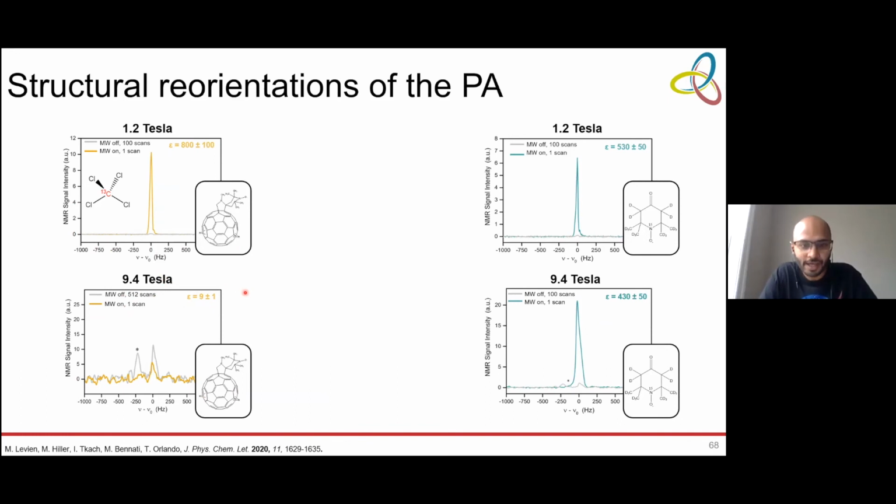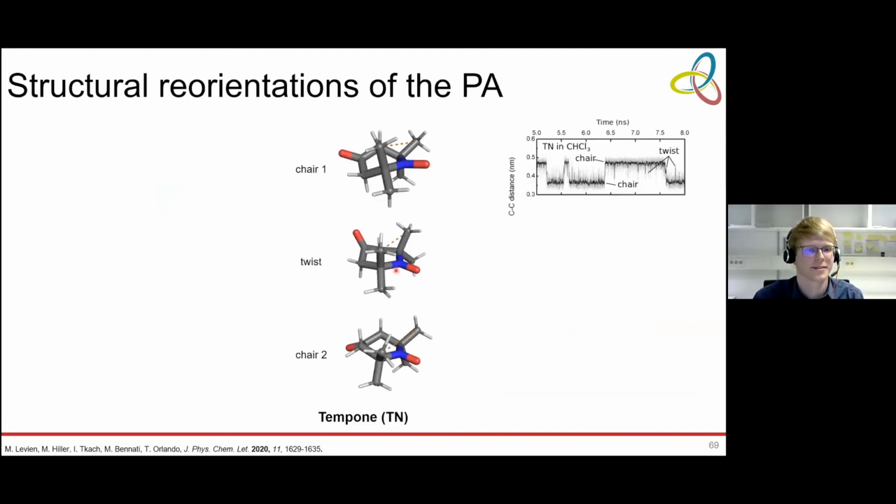Okay, so we have another question from Walt Masevsky. His question is, if your hypothesis about fullerene is correct, can you tune its polarization performance by changing the temperature of the sample? Because then this would enhance this opening and closing. Could be.